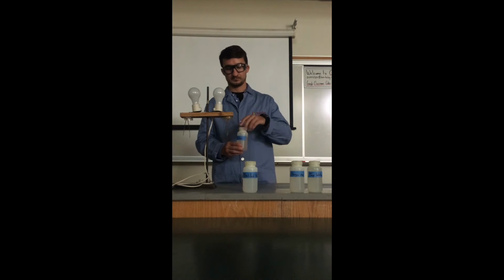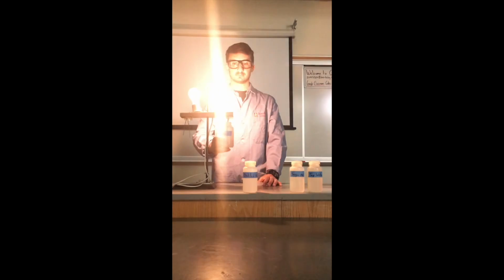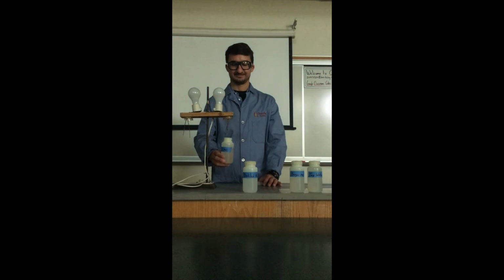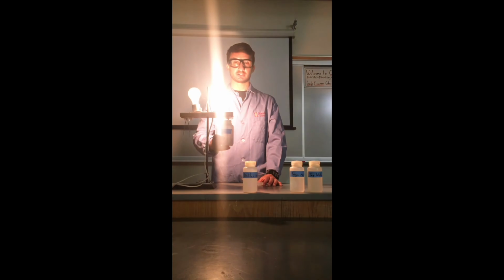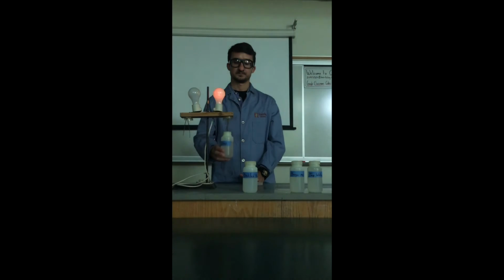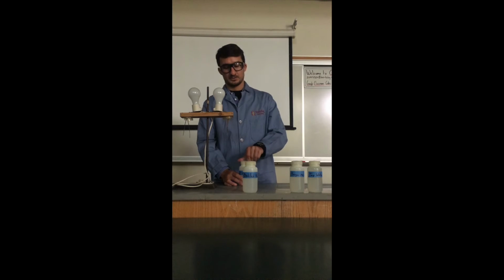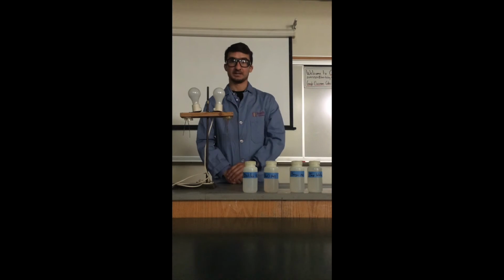Here we go. This is salt water, NaCl, 1, 2, 3. Nice and bright. The solution conducts electric current. Electricity flows through the current, closes the circuit, allows the light bulb to light up. So the pure water did not conduct electric current. If we add a little bit of salt to it, that salt water solution really conducts electric current well.